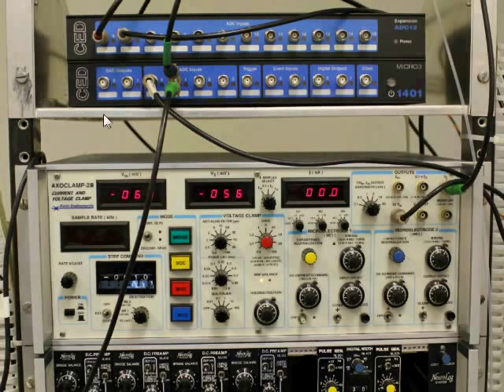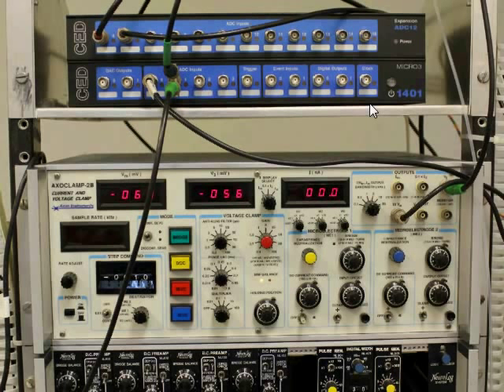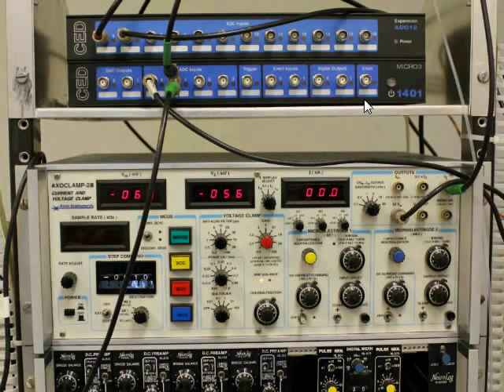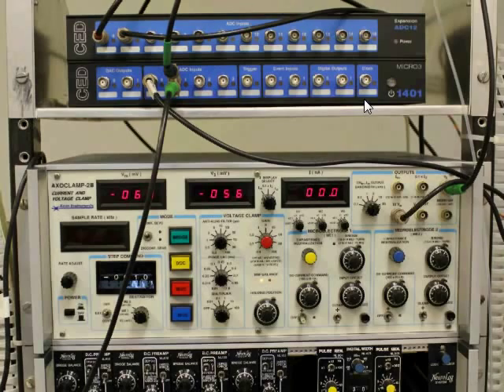Up here you can see the CED analog-to-digital converter we use for the electrophysiology part to record the experiments, separate from the analog-to-digital converter, digital-to-analog converter used for dynamic clamp, which we'll explain next.